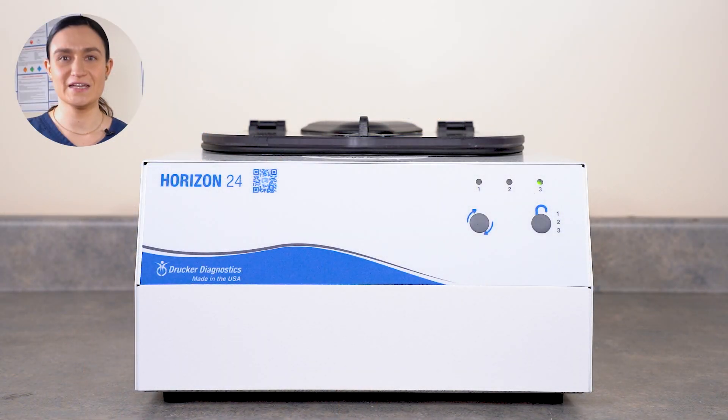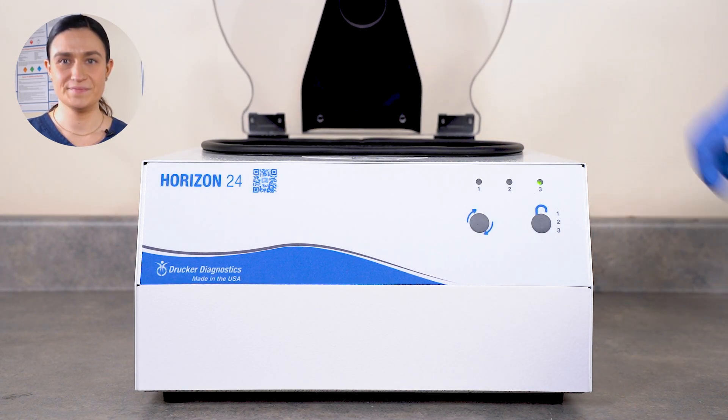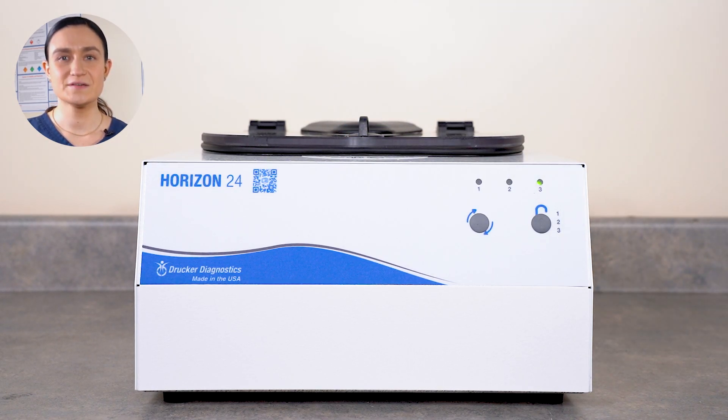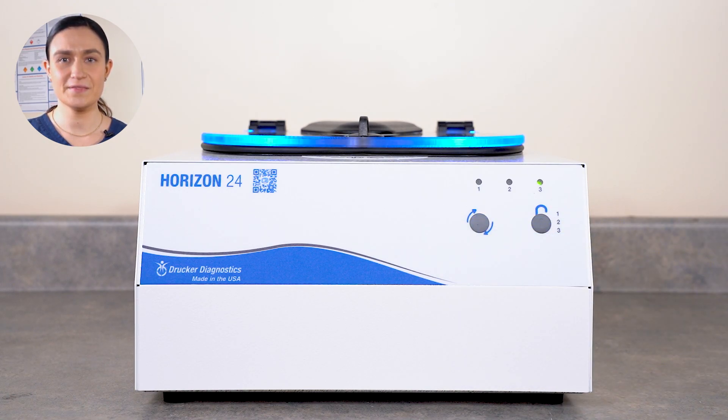Now you're ready to spin. Press stop unlock to unlock the centrifuge. Load your tubes and close the lid. Turn the lid latch a quarter turn clockwise to secure. Next, press the start button. The centrifuge will automatically lock and the rotor will begin to spin, accelerating until it reaches your selected cycle's RPM. The centrifuge will run for your chosen cycle's time.